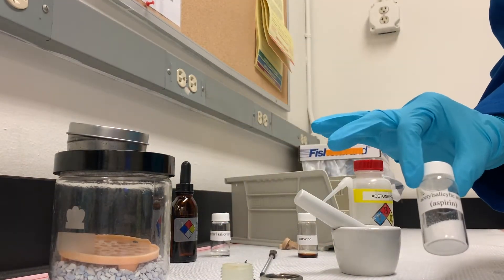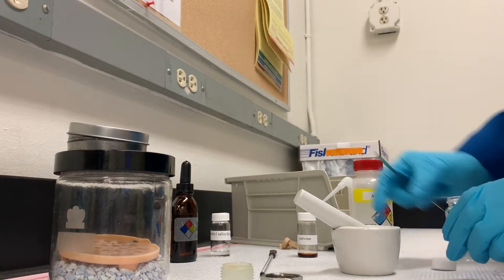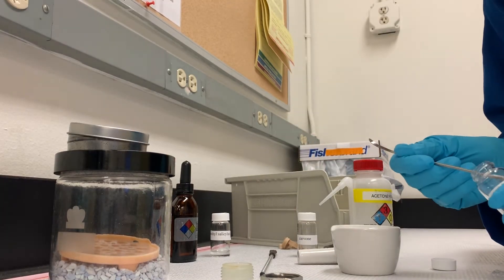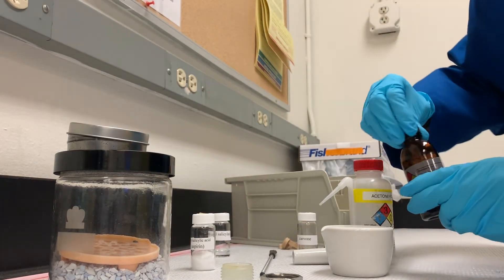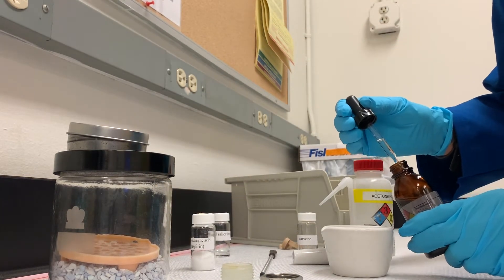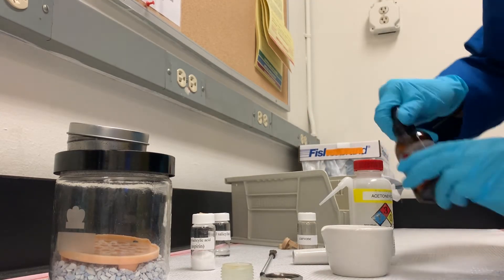For getting the spectrum of aspirin, it's a solid. This is why we have our spatula here. I'm going to take a very small amount. One drop of Nujol, this is a hydrocarbon mixture. This comes out kind of fast sometimes, so you don't even have to press it. Just let a drop fall out. One. One drop.